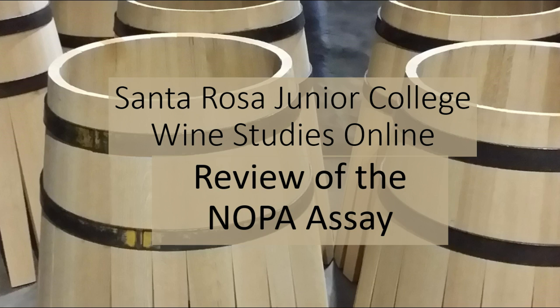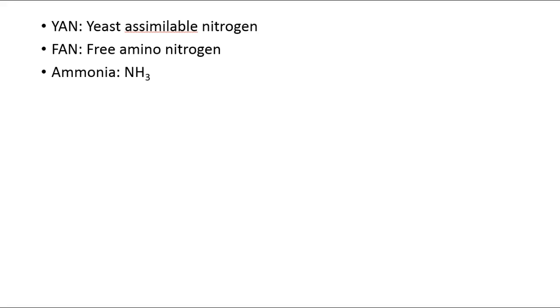Today we're going to review the NOPA assay. So what are we doing when we use the NOPA assay to test nitrogen? We are interested in the total amount of nitrogen in a juice because that nitrogen feeds yeast and will ensure that we get through our fermentation successfully. The total nitrogen that feeds yeast we refer to as the yeast assimilable nitrogen. So that's what yeast can assimilate.